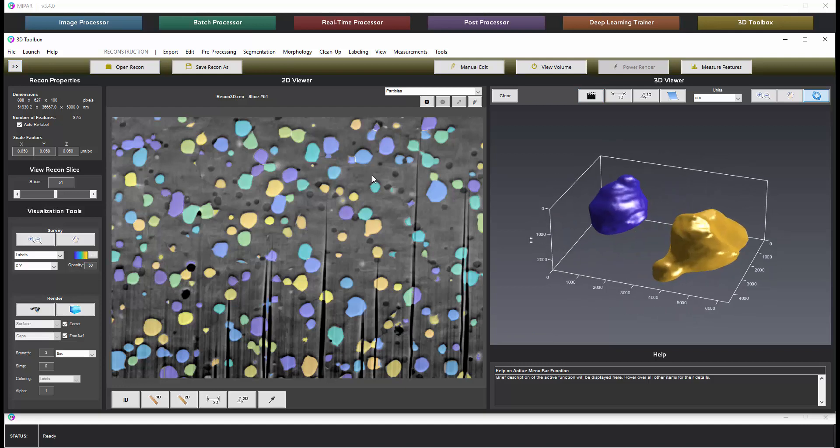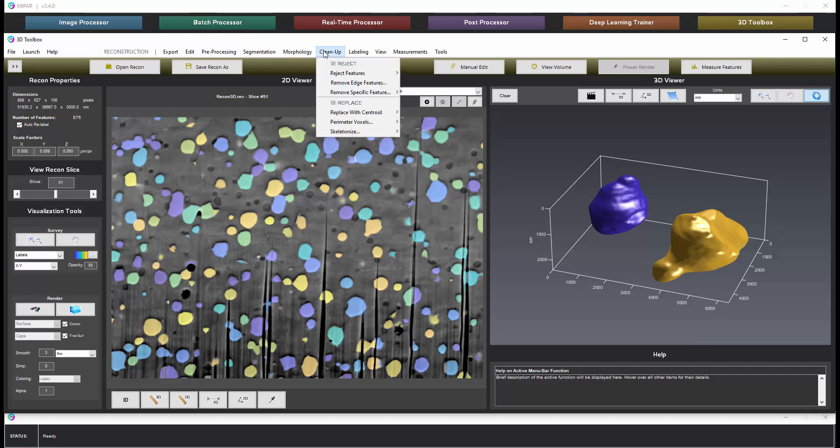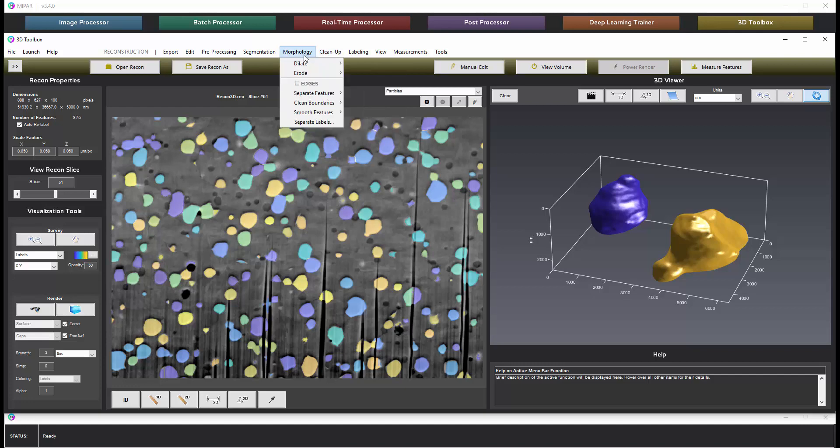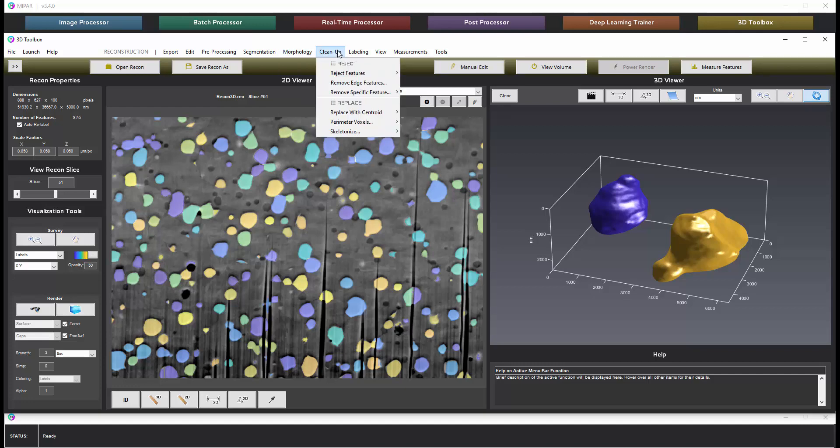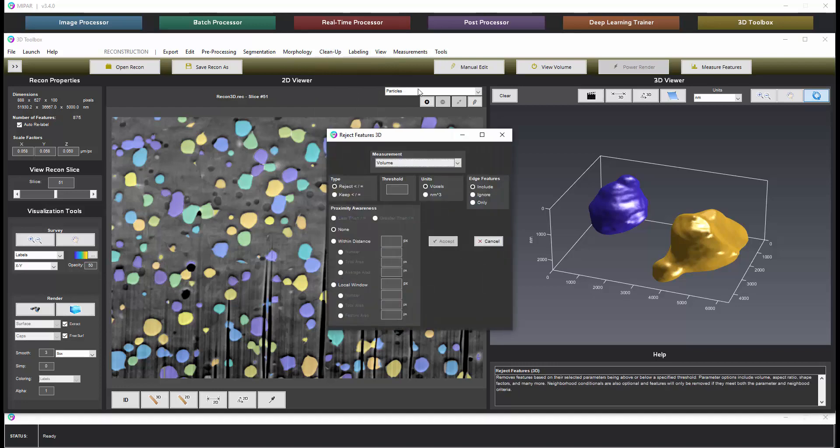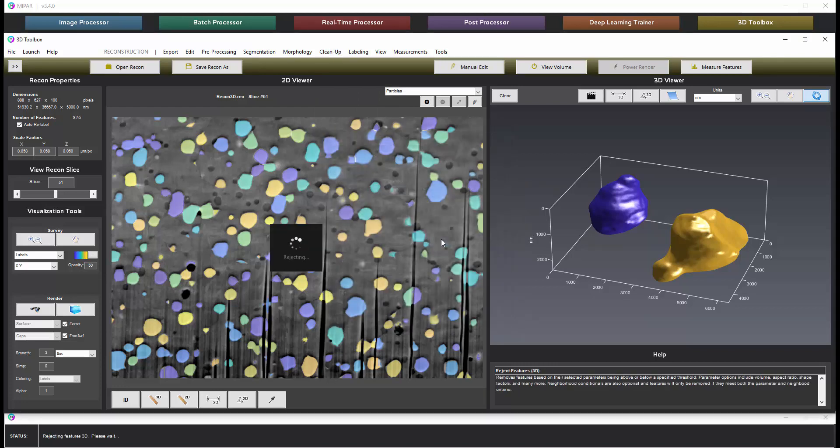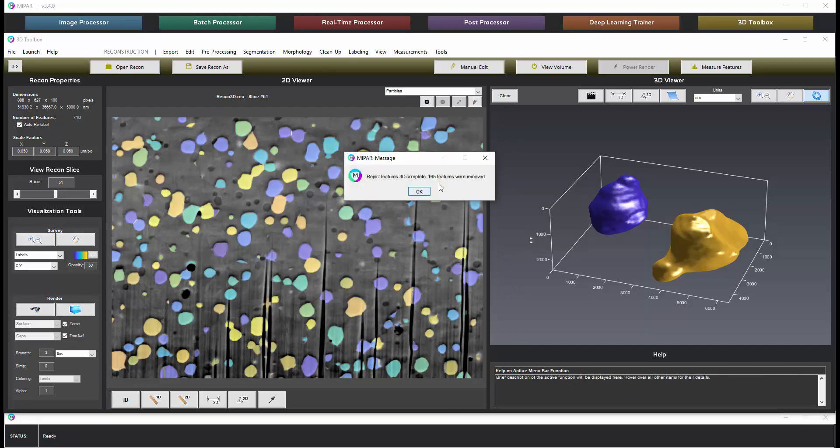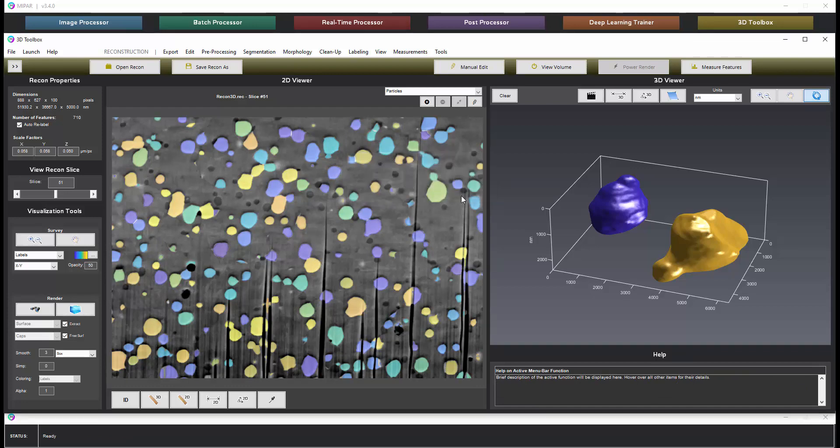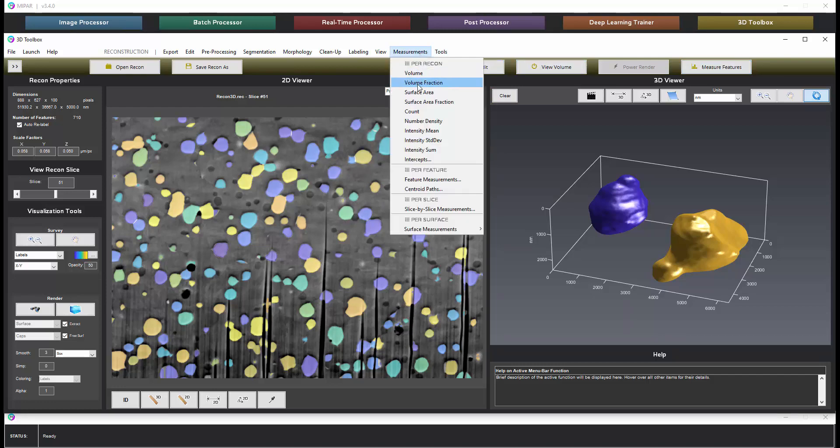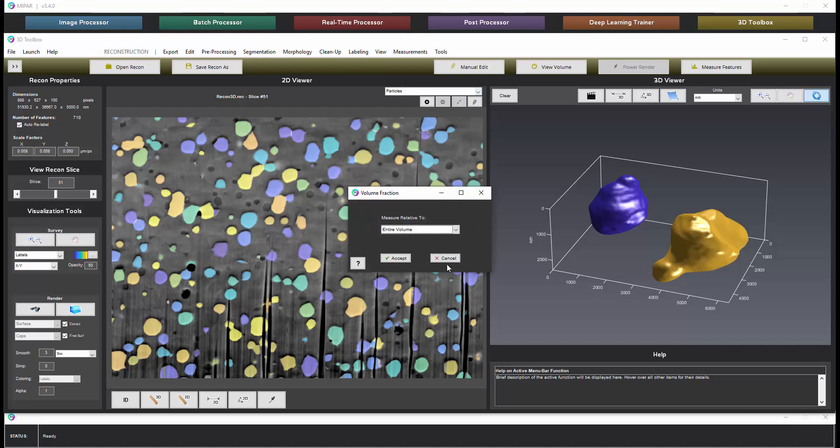If we want to make measurements we first suggest removing some of the noise features. Generally features under 100 voxels can usually be removed. That can be done under cleanup, reject features, 3D. We'll choose 100 and say accept. This is similar to a reject features in 2D but working in the 3D volume we see that's removed 165 features.